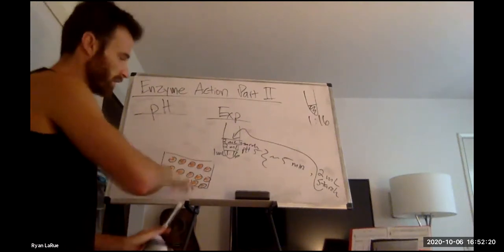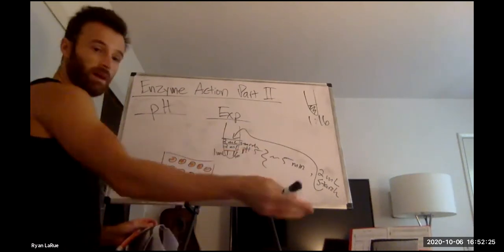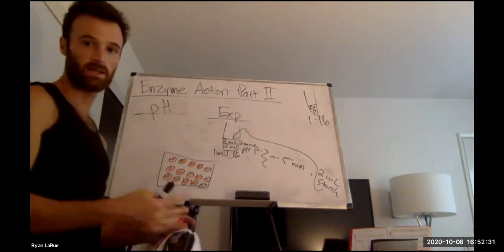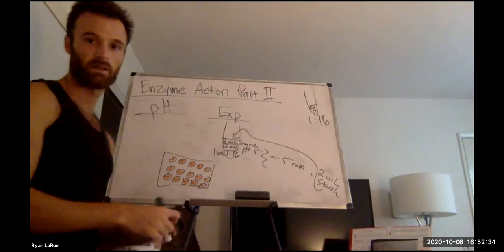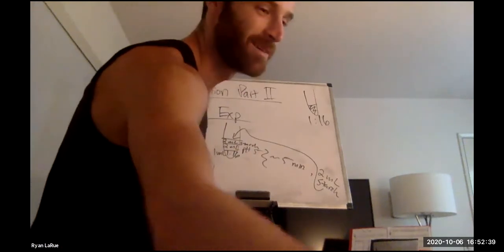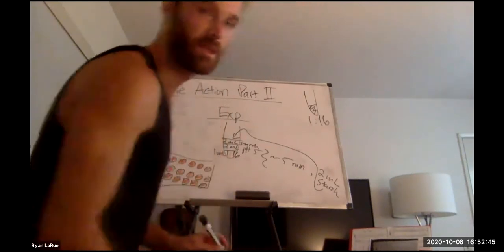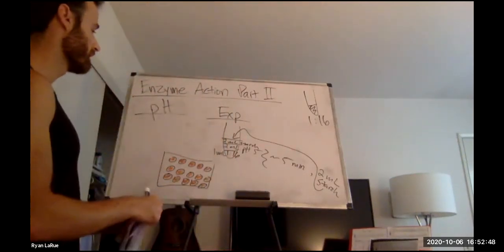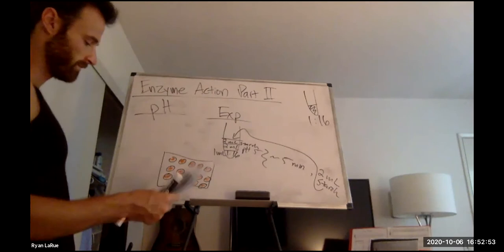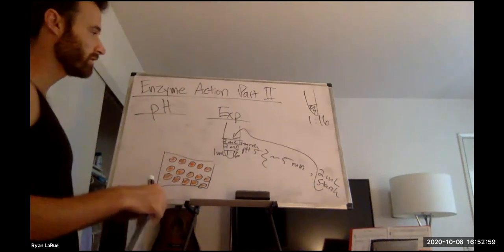And then for the other rows, you would replace pH 5 with the other pH solutions that we have in the lab and do 2 milliliters of pH 7, pH whatever. Got pH 6, 9, 11. She has the data for it. So that's how you do it with pH. Same negative, positive controls. Last but not least is temperature, and subjecting your tube to different temperatures.